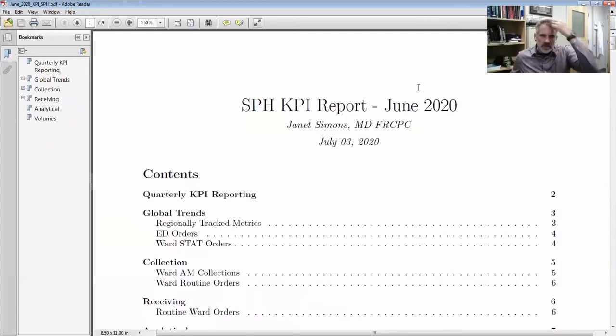Dan Herman mentioned something very important, and it's something that Stefan is enthusiastic about, and I'm enthusiastic about, and that is R is reproducible. What we mean by that is if you run the same code, you get the same report. Now, you can produce reports in just about any kind of format you want. You can make static Excel reports or CSV files. You can report out to a database. You can make a PDF. You can make HTML. You can make web apps, and we're going to be seeing some of those later.